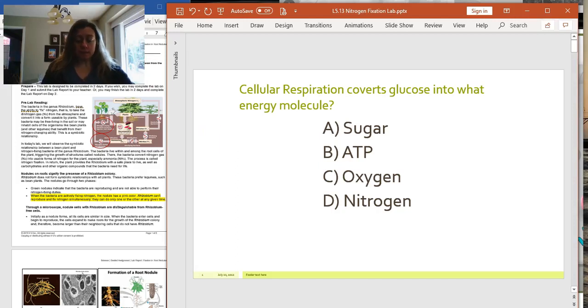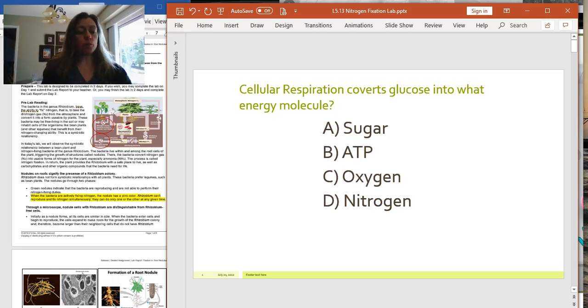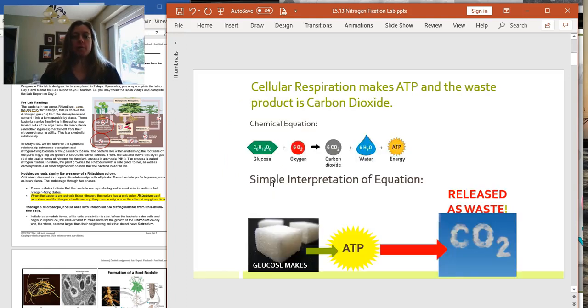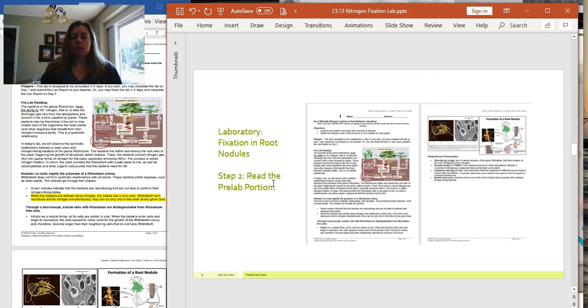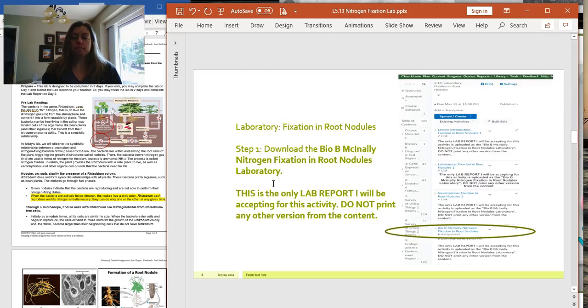Good morning. It's May 15th, and we've been talking about the nitrogen fixation root nodule lab, which is pretty hard to say. But essentially, we're on day 2, and we've already covered a lot of these slides in the presentation. So I'm going to scroll through here. We're going to talk about what we need to do to wrap up day 2 of the nitrogen fixation lab.